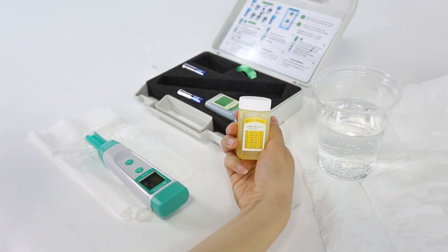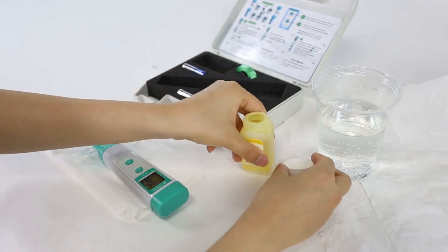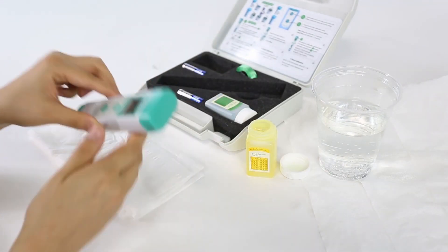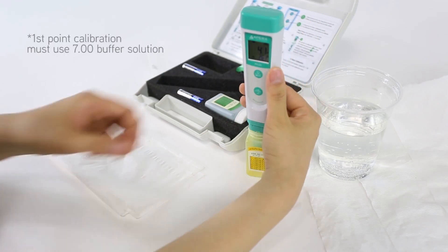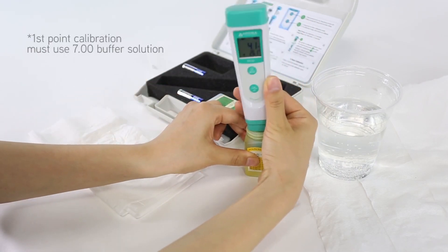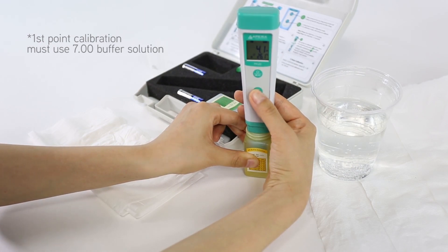For second point calibration, dip into 4.00 calibration solution and follow the same steps that you did in first point calibration. Please note that first point calibration must use 7.00 calibration solution.